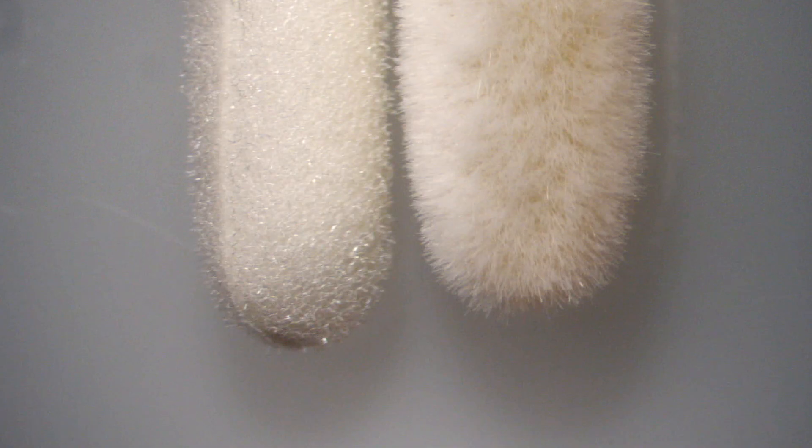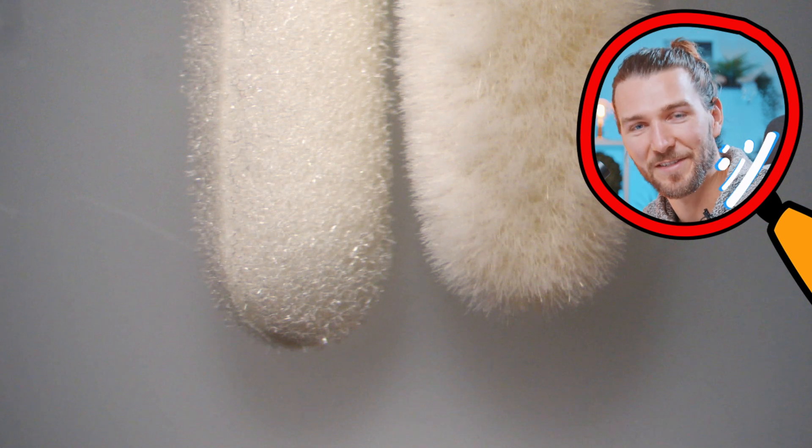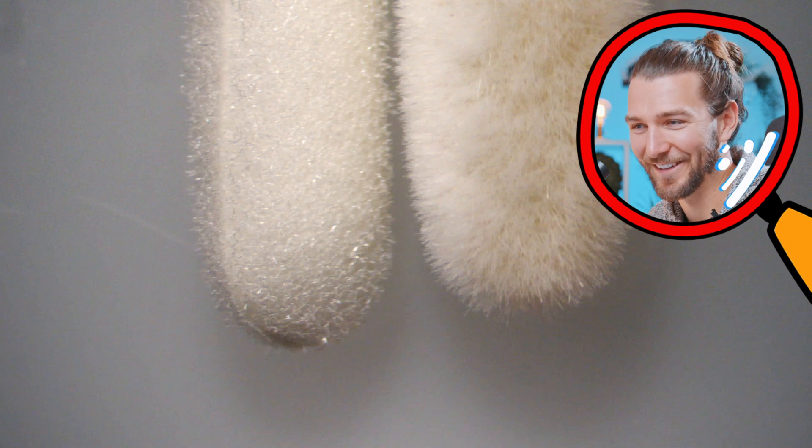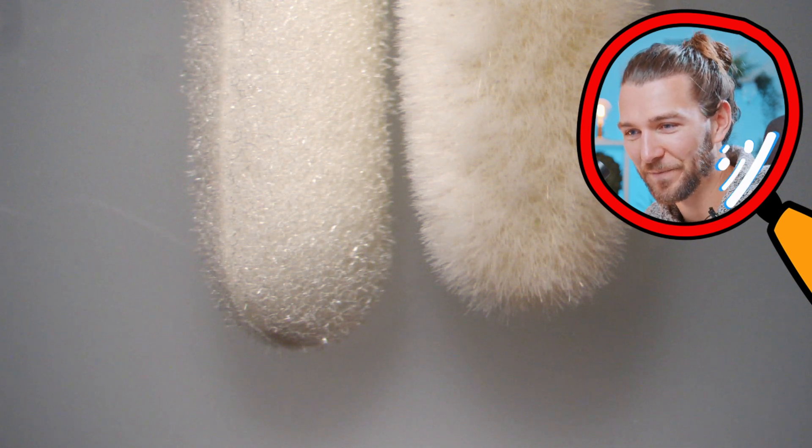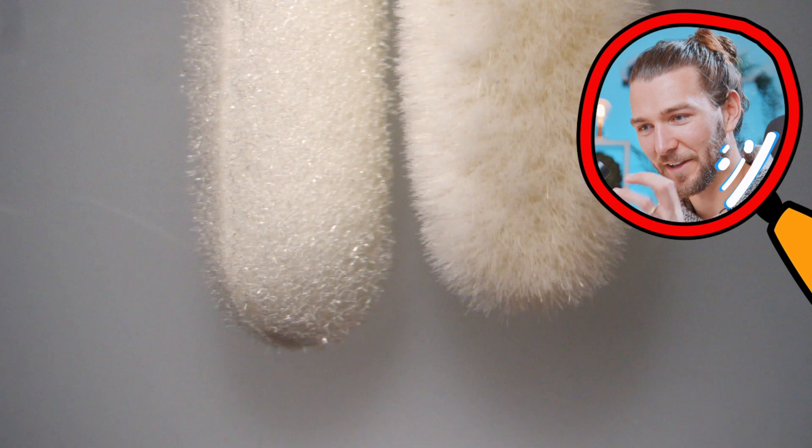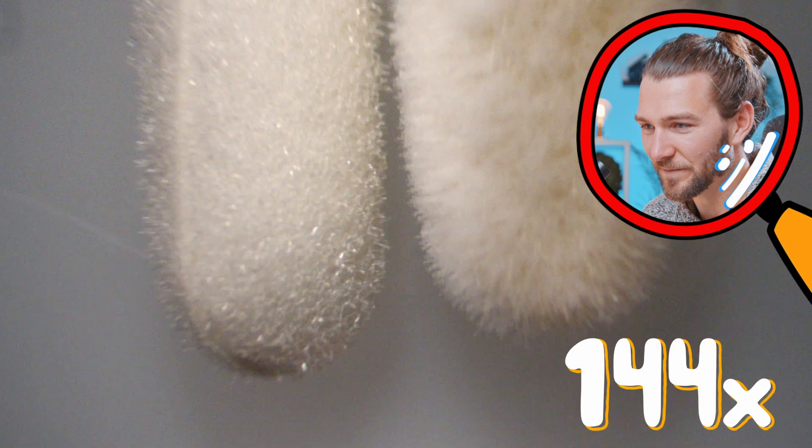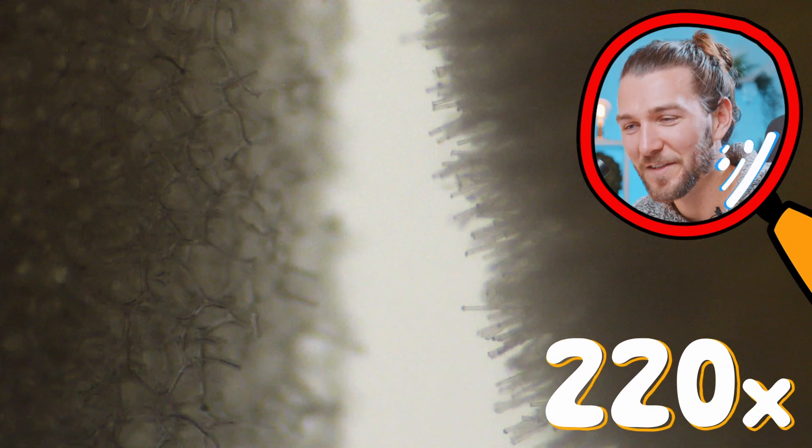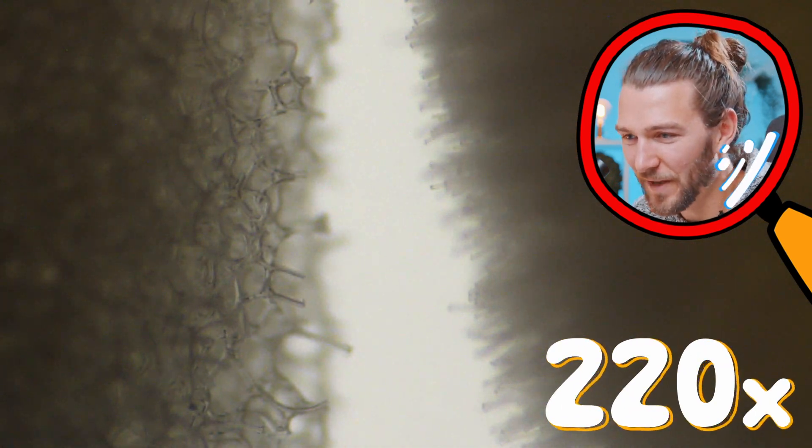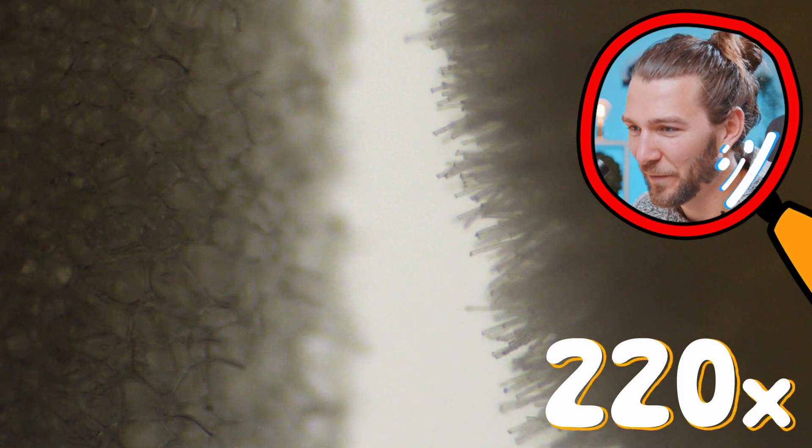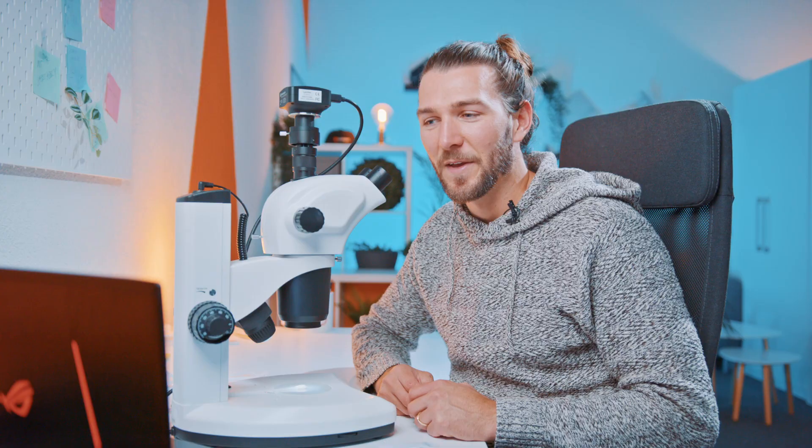This one that's more sponge looking, it's for sure a bit more sturdy and has a lot of excess material that could possibly also fall off when you're getting it in your nose. Now I put the two of them together so you can see side by side simultaneously how they look like. So the one is super fluffy, you can see that, and the other one is much more sturdy and has a layer of like this foam, foamy structure. So let's zoom in here a bit. So on the left side you can see the sponge, super sturdy and rough, excess material. And on the right side the furry swab that is super dense.